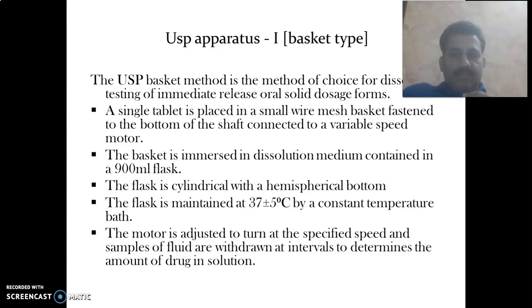It is the method of choice for the dissolution testing of immediate release oral solid dosage forms. A single tablet is usually placed in a small wire mesh basket that is fastened to the bottom of the shaft connected to a variable speed motor. The basket is immersed in a dissolution medium, usually in a 900 ml flask, and in that flask we take the dissolution medium.